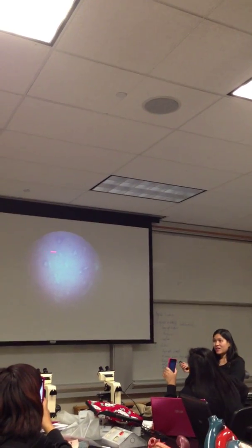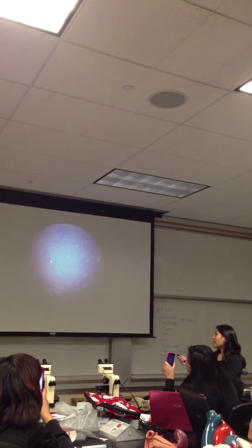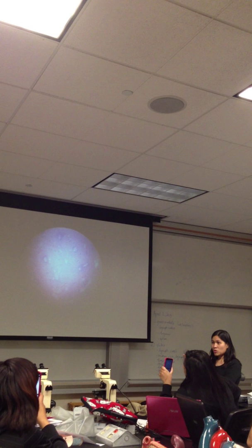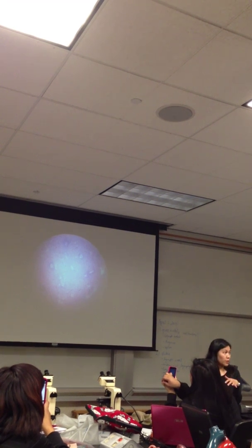Now this one, you've been clamoring for, the spleen. The way you can distinguish the spleen, you know how there are also aggregates of nodules in the lymph nodes. These will have different shades because you have a red pulp and a white pulp.